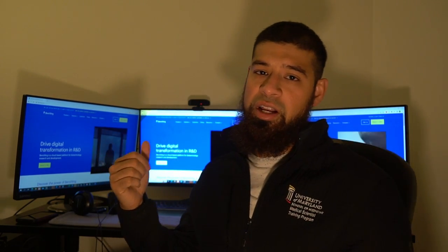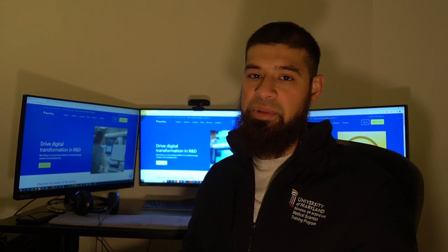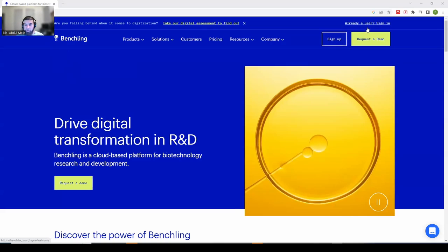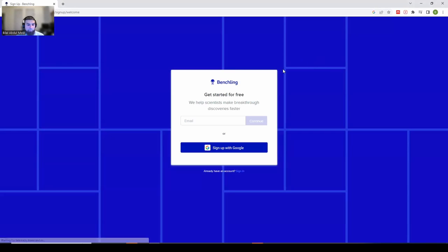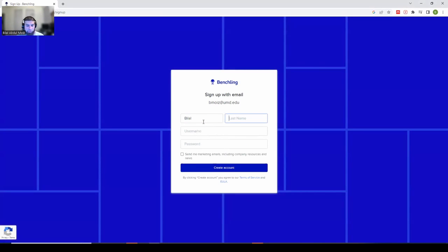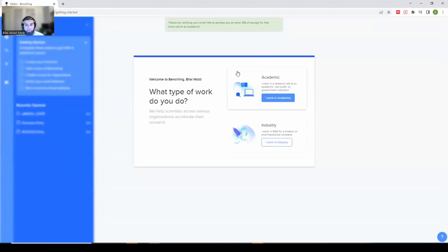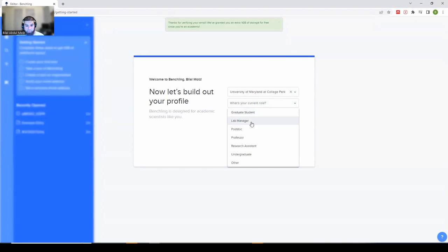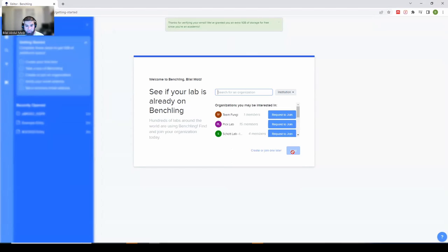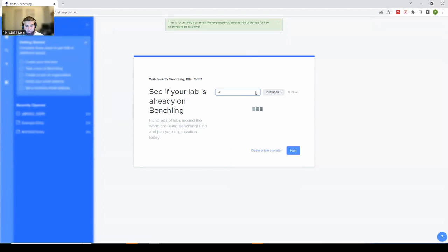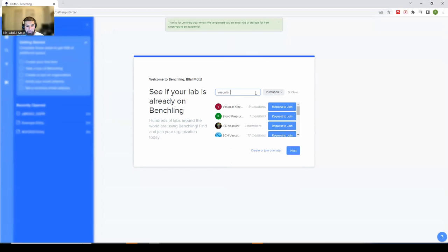All these features together made Benchling feel easy to use and superior to something like OneNote for lab documentation. Let's go over to the computer for a quick walkthrough. Here on the Benchling home page, you can easily sign up using a Google account — just name, username, and a password. I'll verify this and we're in. I'll select the academic option and build out my profile.